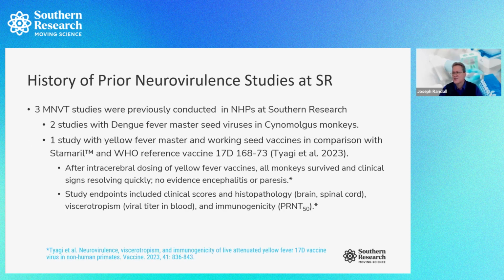At Southern Research, we previously conducted 3 neurovirulence studies in cynomolgus monkeys. 2 studies were conducted with dengue fever master seed vaccines, and we're not going to be discussing that today. I will be discussing 1 study with yellow fever master and working seed vaccines that were tested in comparison with a commercially available yellow fever vaccine, Stamaril, and the WHO reference vaccine, 17D 16873, which is a live attenuated virus.